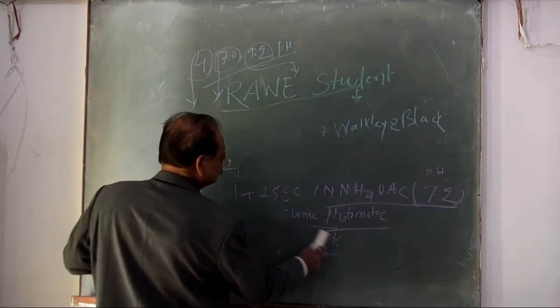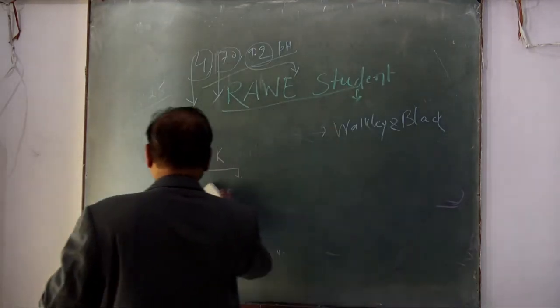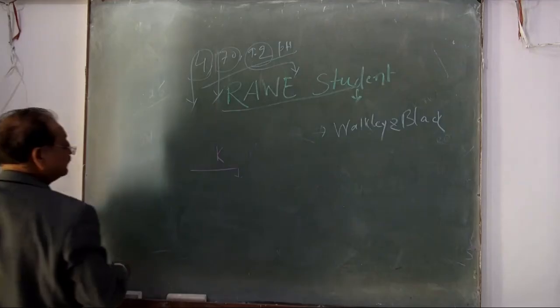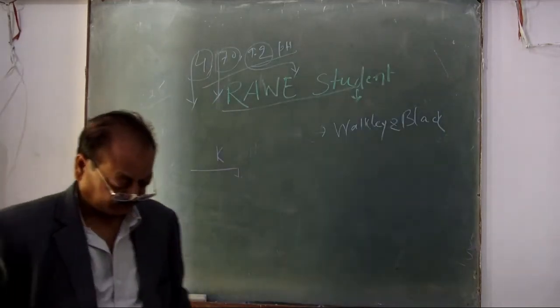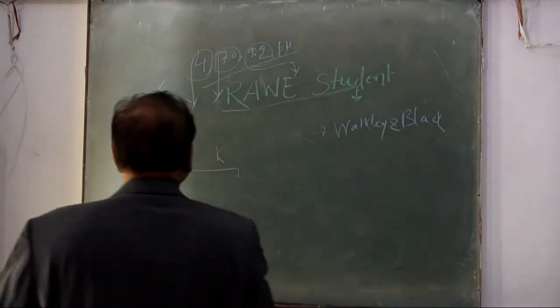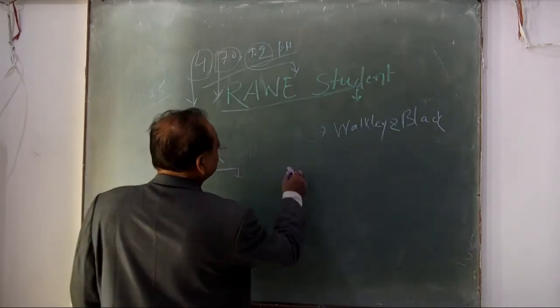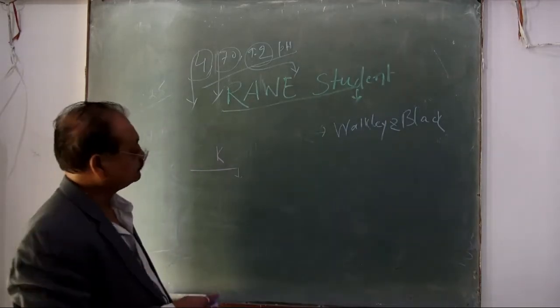Now, how do you prepare the standard solution? Let's suppose you have to prepare the standard solution of potassium.